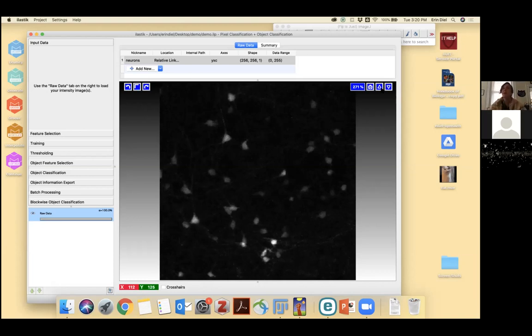And it's definitely not saying this is a cell that's dividing or a cell that's dead or a cell that's CFOS positive or whatever it might be. And so that would be an example of instance segmentation, which is what you can do in this kind of workflow where you start with pixel classification and then you do some object classification, which is more of that instance classification. So again, you start with your input data.